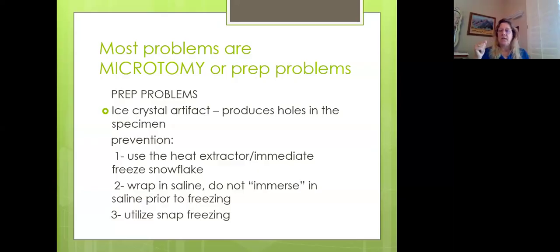Sometimes you are going to have to send out a raw tissue, and mostly it's muscle, that you will receive in the lab for frozen. There are very few labs that actually have the ability to freeze muscle because what they will do is snap freeze it, and then they're going to do enzyme histology on it.